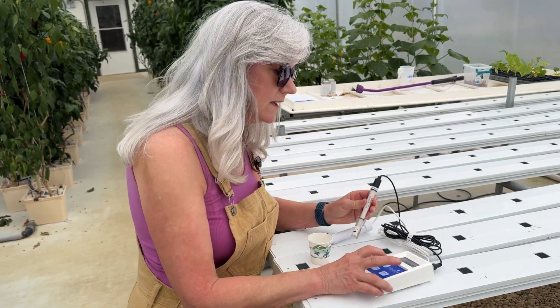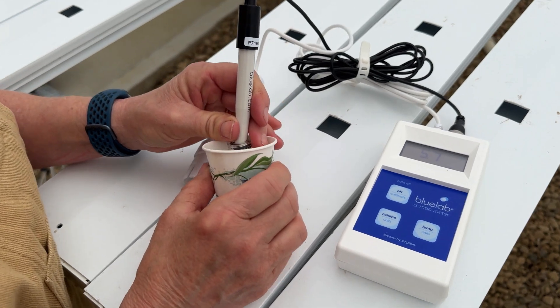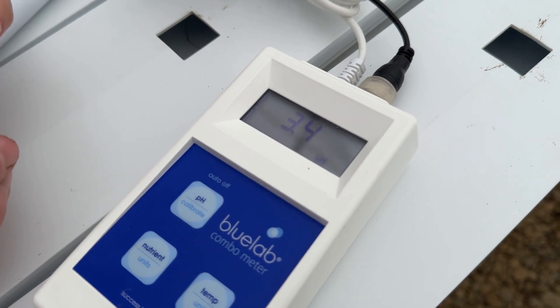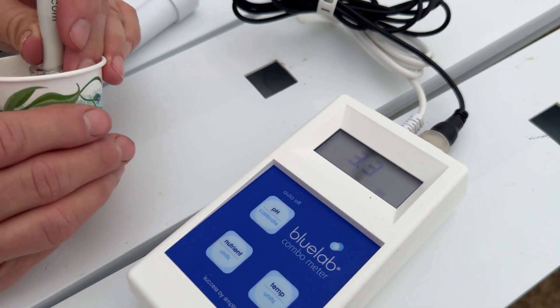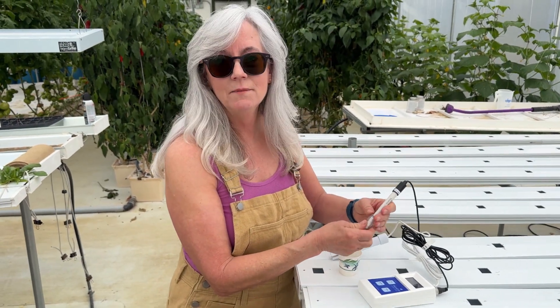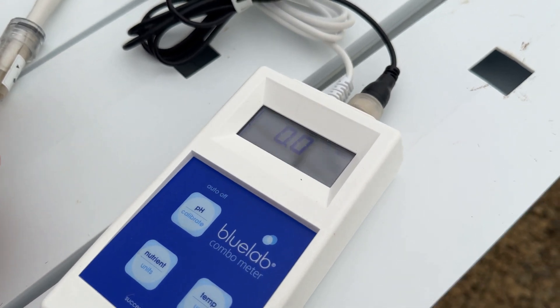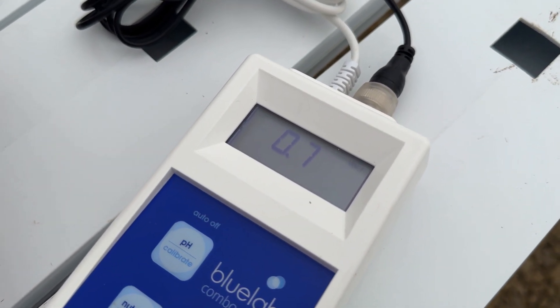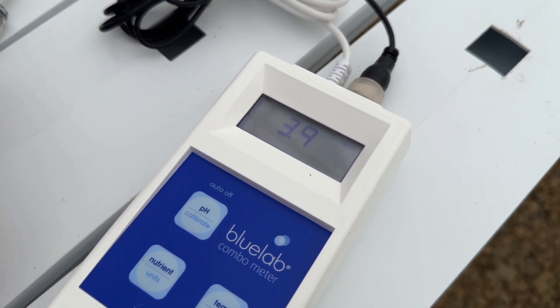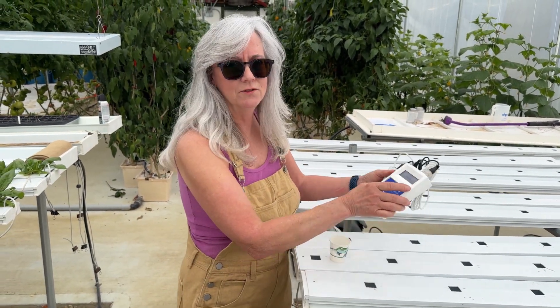Water sample collected, probe turned on, switched to pH mode, removed the storage cap, and stuck it into the nutrient water. This doesn't look good — it's going down. It's supposed to be around 6.0, and it's at 3.3. No wonder my plants look terrible. I'm also going to check my EC — that should be about 2.0 to 2.2, and oh my gosh, it's 3.5, and still climbing. I better get this fixed up. Let's go right into the control tunnel and see what's going on.